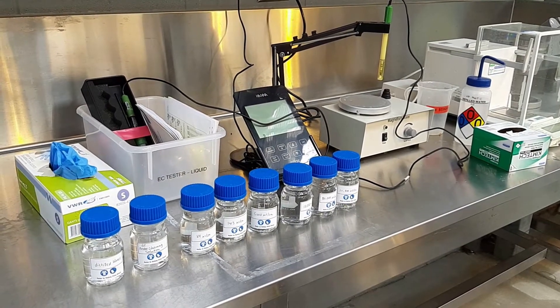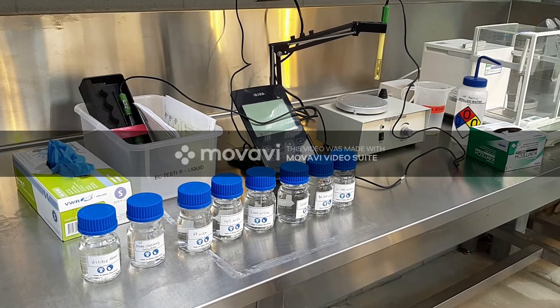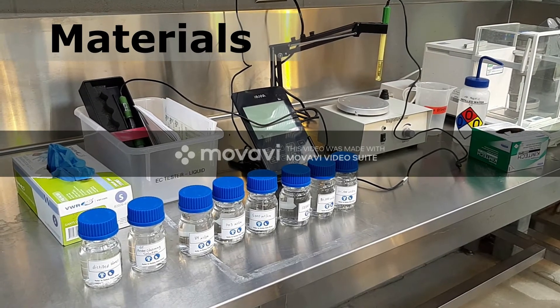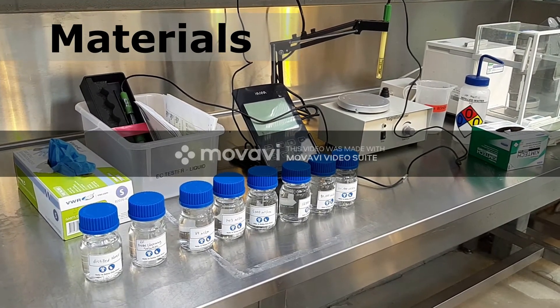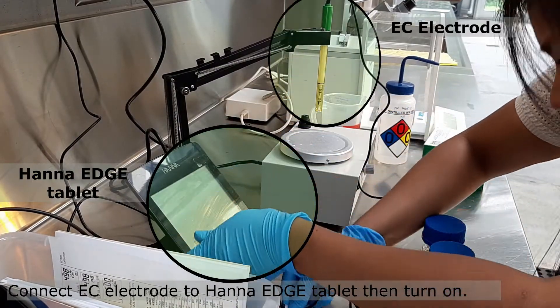It cannot tell us the specific concentrations of each nutrient. Here are the materials that you will need to measure the EC of your solution. We need the HANA Edge connected with the EC electrode.